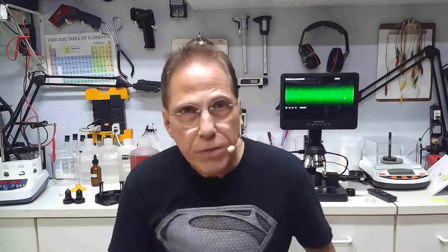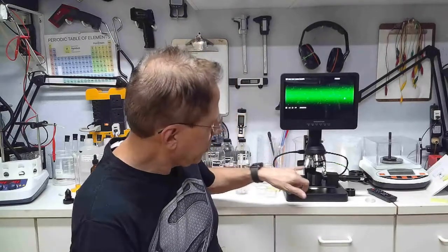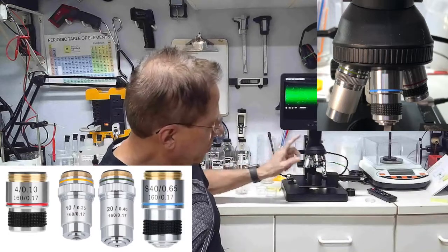Last week we talked about the lenses in the microscope that came with the Instar microscope. We were unable to identify the power of those lenses because the manufacturer doesn't tell you the power. I wasn't completely happy with them, so I ordered new lenses — a 4x, 10x, 20x, and 40x — and the microscope is now outfitted with all of those new lenses.